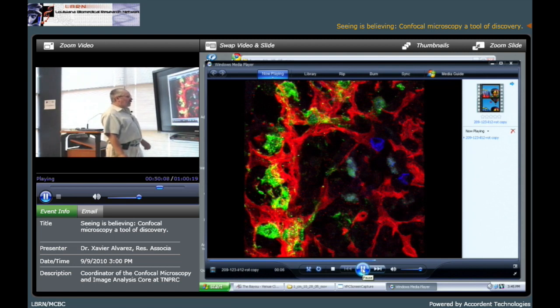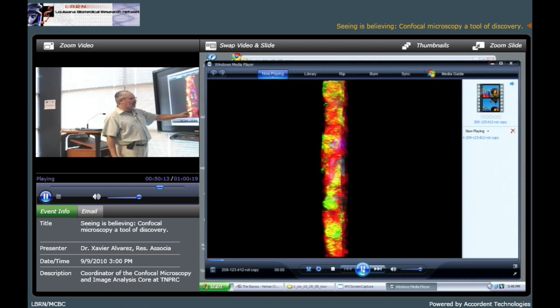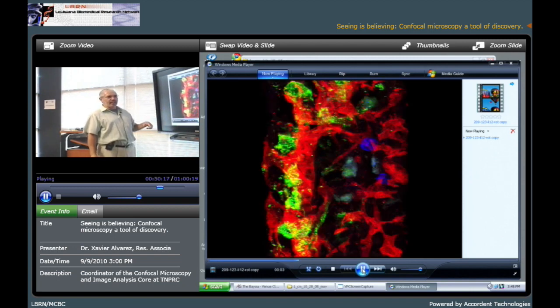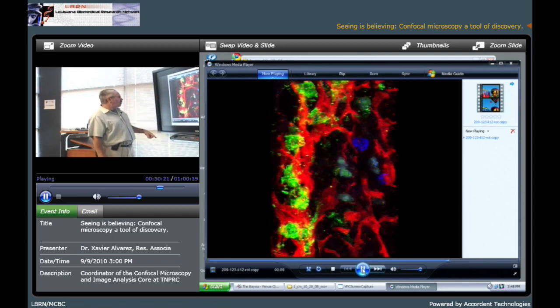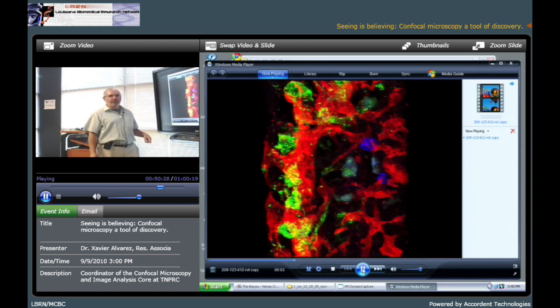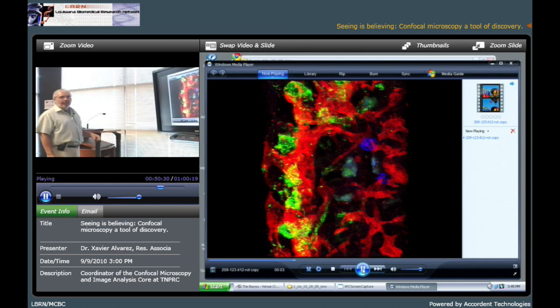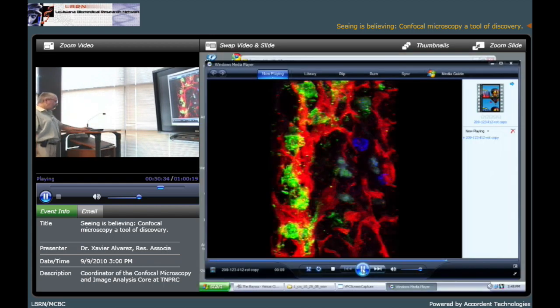And the red cells are dendritic cells. We found that they form all this basket around the lymph node. These are the elusive dendritic cells. It's a pain trying to stain for them, but you can see them functional.